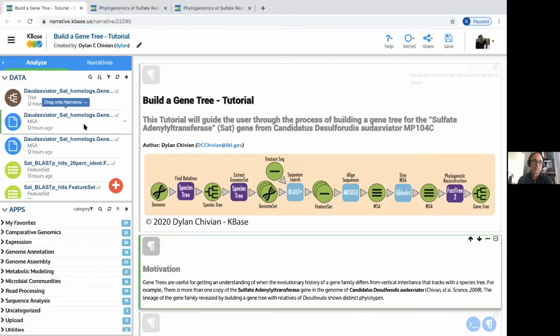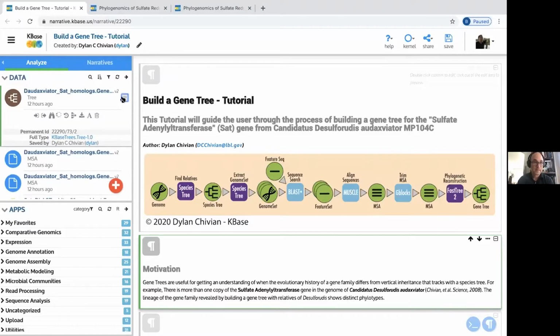Fortunately, I'll go through a little bit of the foundations of using KBase in the narrative. So for example, the layout of a narrative, this is one analysis session in essence. It's like an e-notebook kind of, but it can be computed. And in the upper left here, I'm hoping you can see my cursor moving. This is the data pane, and in it we have different data objects, and data is represented in KBase as objects that are structured, and so you can examine information like this tree is a structured object, and you can get information about it.